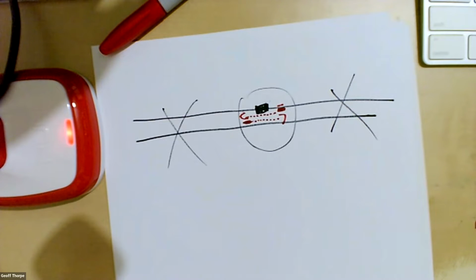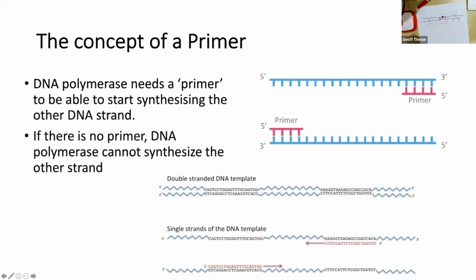So I'll just go back to sharing. That picture that I drew simply is basically what this is showing. If we say the part of the DNA we want to amplify is this little bit here, we're just going to choose primers that are complementary to a little bit of sequence on either side of the DNA that we want. So that's where we go down to here.